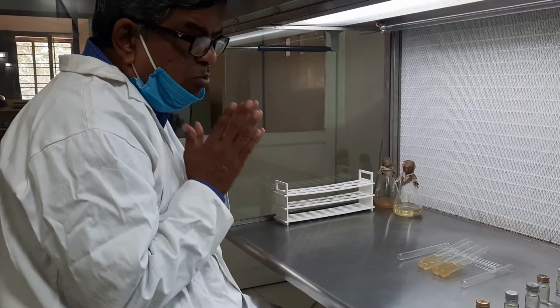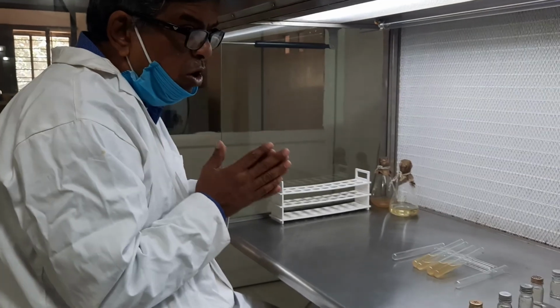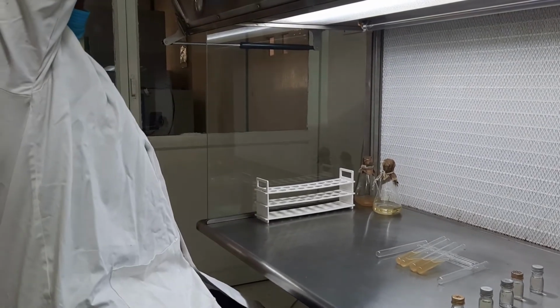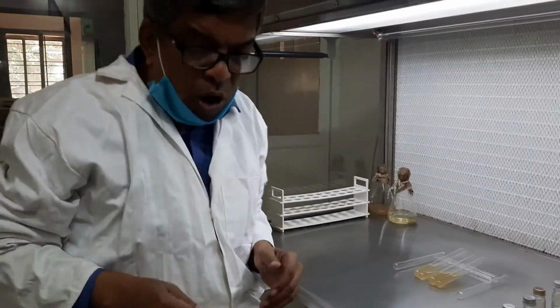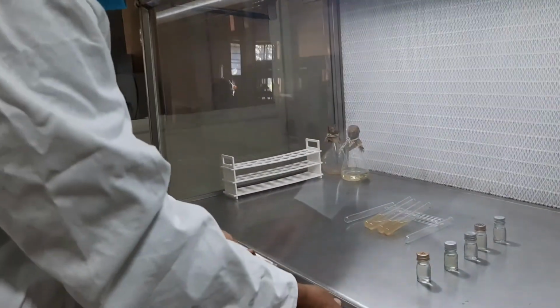After 1000 hours the UV light has to be changed, it should not be used. If you have any other question, please feel free to ask me in the group. I shall answer you when I get the question.